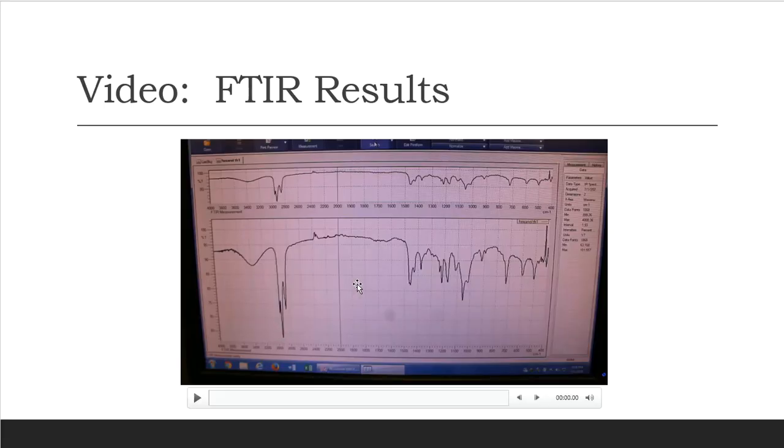All right, so this is a video, and it's the final slide, the final thing that I need to tell you about the FTIR run of the hexanol product that we've made.